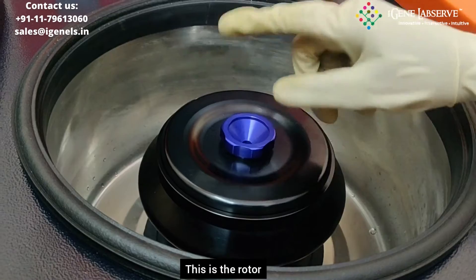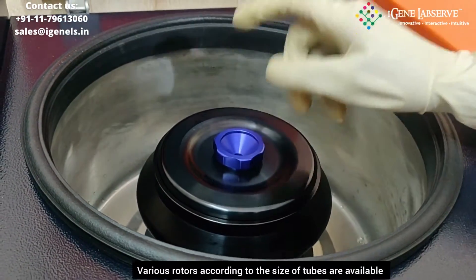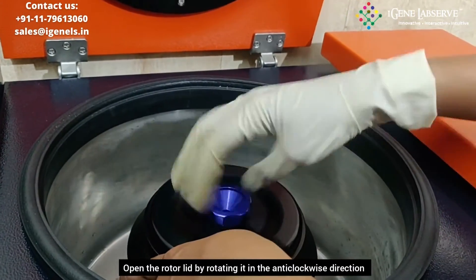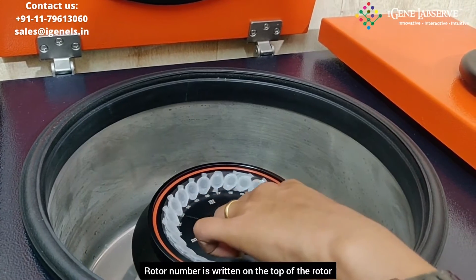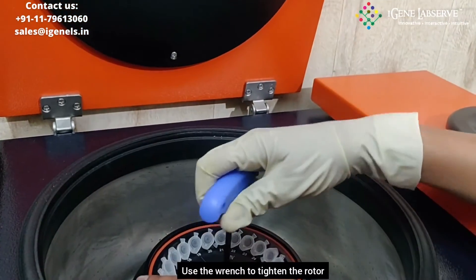This is the rotor. It can fit in various rotors according to the size of tube that you require. This is rotor number 3. To open the lid of the rotor, you have to use this. The rotor number is written on it — this is rotor number 3. This wrench is used for fitting in the rotor.